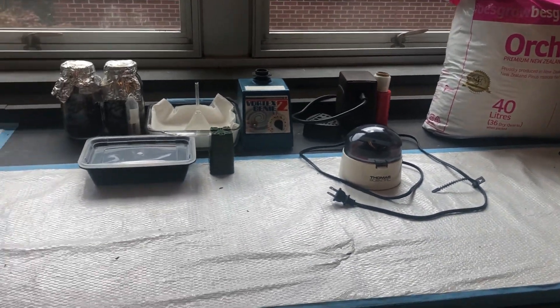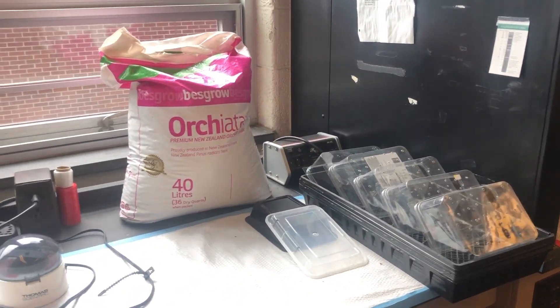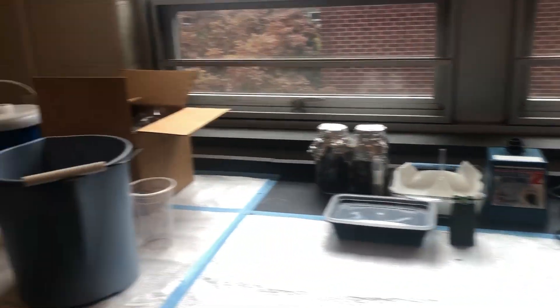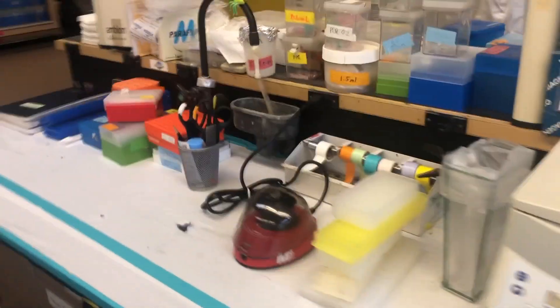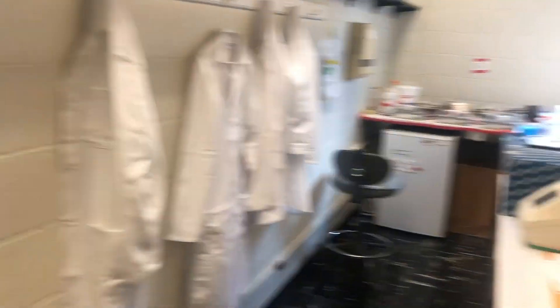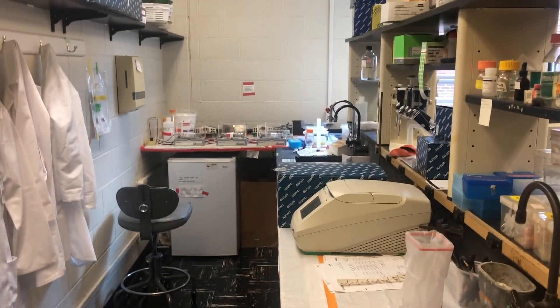This is my orchid potting area right here — my orchid bark and some of my containers. This is some of the other part of the laboratory: there's a big tabletop centrifuge, a microfuge, and various equipment that I use as well. And then again the lab coats, and here is another bench space area. So this is the wet lab portion of the laboratory.